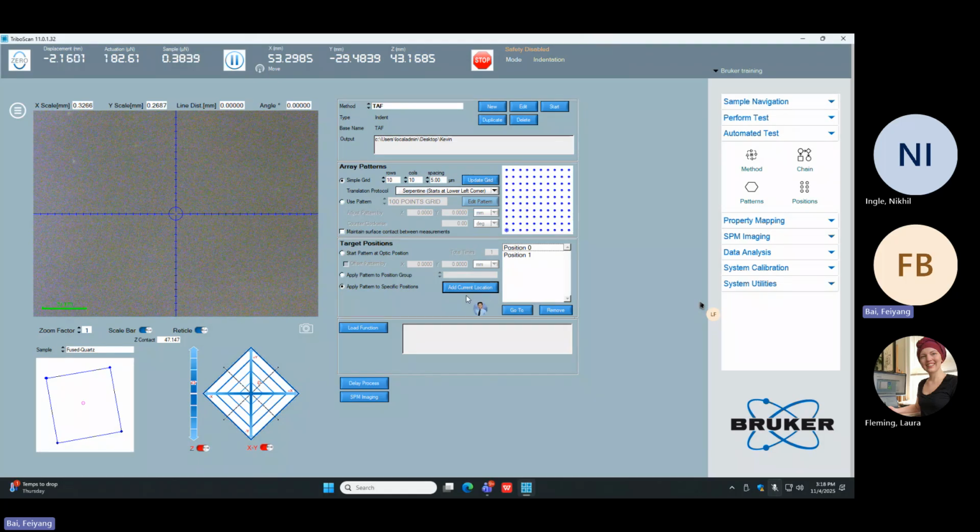Oh, okay. But for this position number 2, that is position 1 here, we cannot have a different load function. Correct. Okay. Yeah, let's go to the load function next, and maybe it will help it make sense, actually.